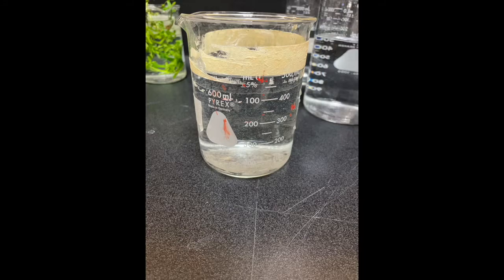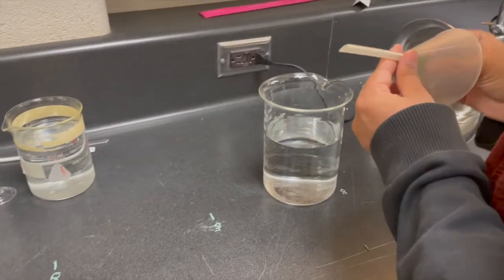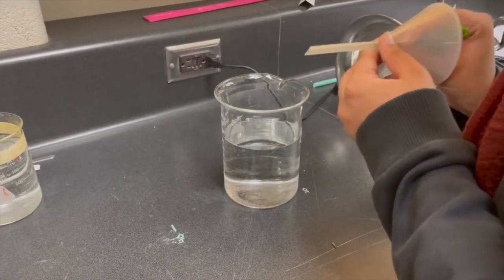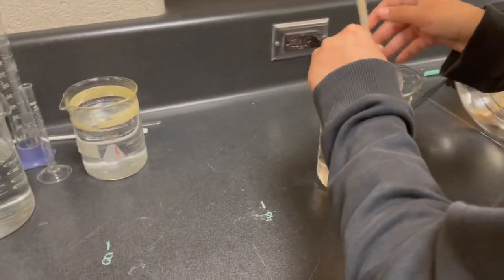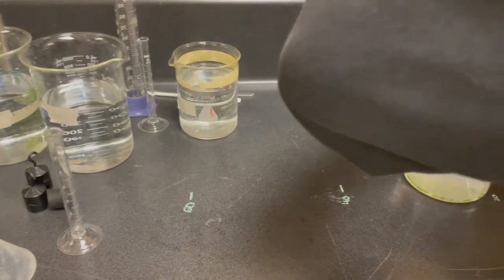We took another separate beaker and measured out 500 milliliters of water using a graduated cylinder and mixed it with 1.5 grams of baking soda and stirred the solution. We later took a stem from the plant by measuring and cutting the length to 10 centimeters and repeated this process until we had achieved 6 stems, 10 centimeters each. Using these stems, we trimmed the ends off of all 6 stems by cutting them at an angle.